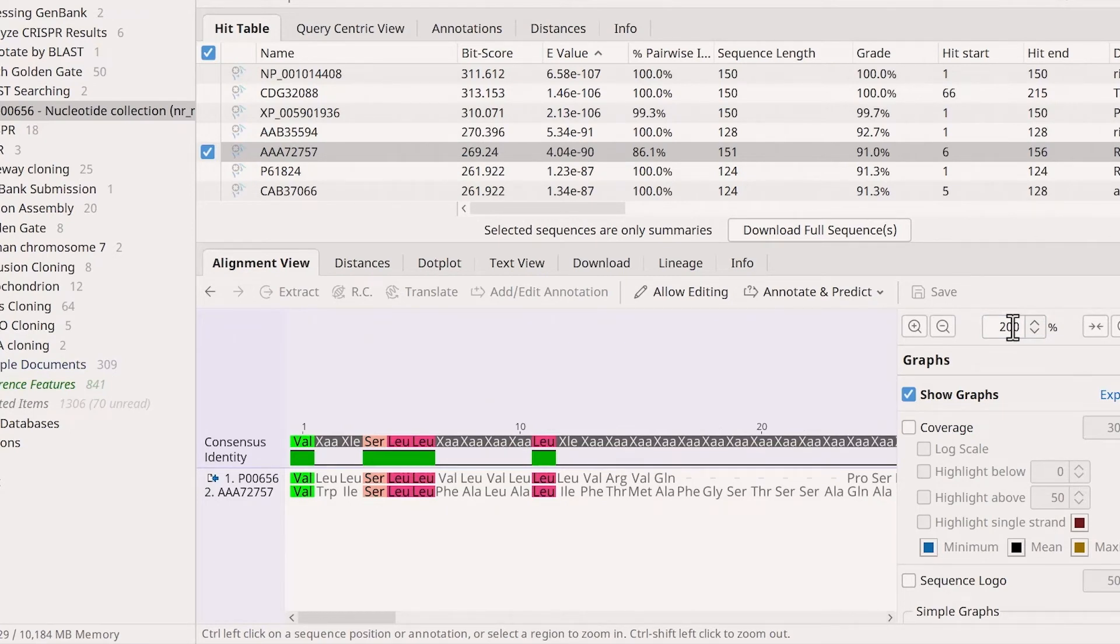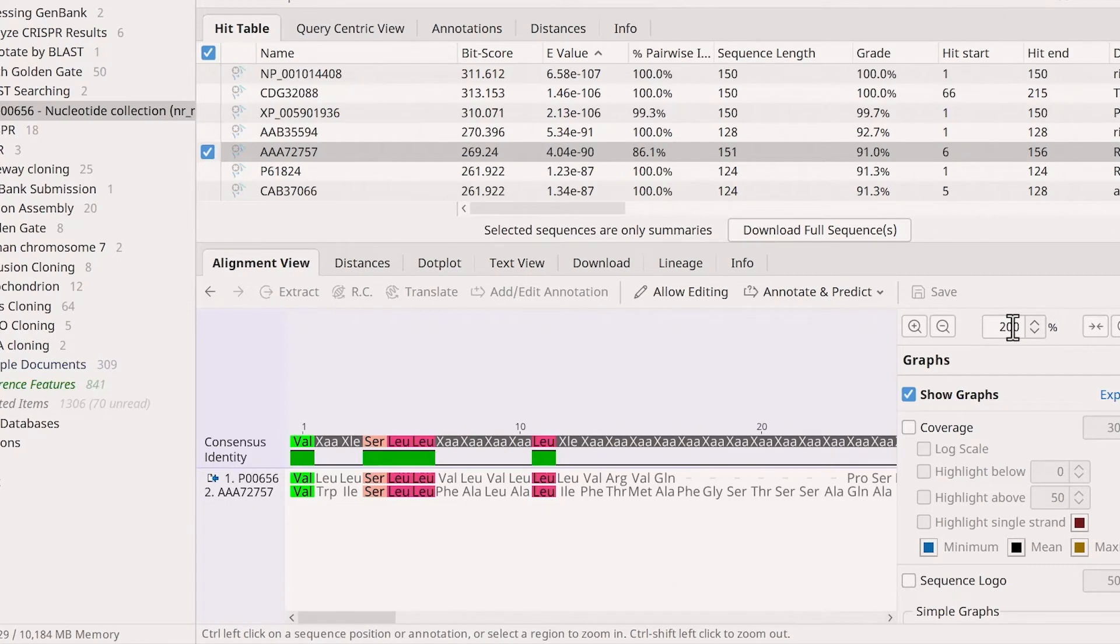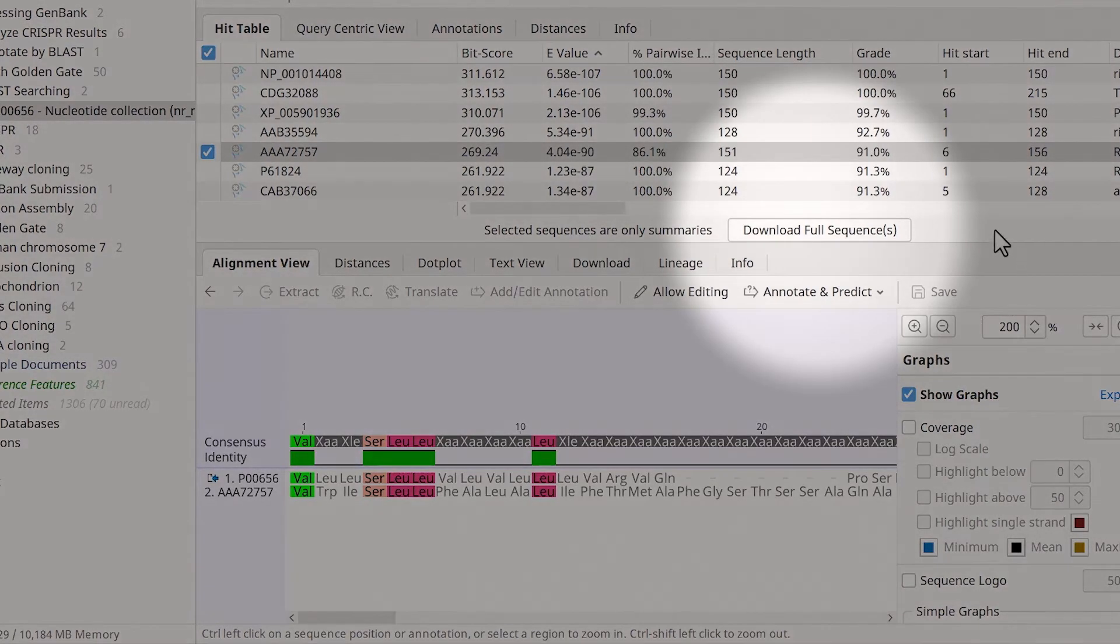It's worth noting that the BLAST results only show the region of alignment between the query and the hit sequence. To get the full sequence and annotations for the BLAST hit, select the download full sequence button.